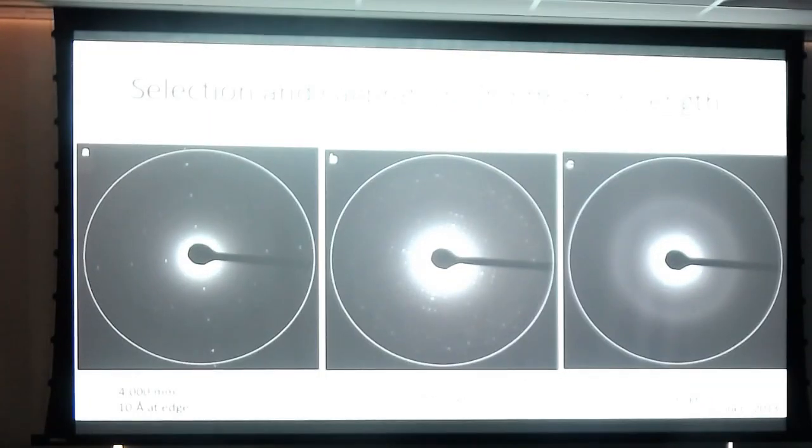You also have to choose the camera length. I just called it diffraction length here, but it's the camera length. So basically, like I was saying, there's not a defined position on any microscope when you're in diffraction mode where these spots are. Instead of a magnification, you have what's called a camera length. So you're sort of changing the magnification of the diffraction pattern on the detector, and it calls that a camera length.